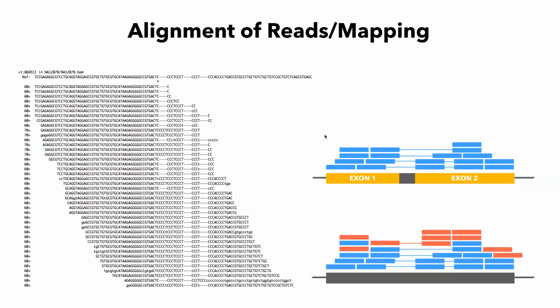The other thing is we, of course, talked about the single end and the paired end reads. And here you can see how those reads would be aligned to exonic regions, and then how we can use the paired end alignment so that we better understand what is expressed and what is not expressed.